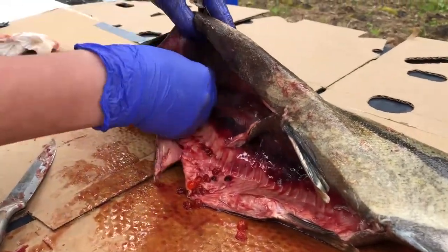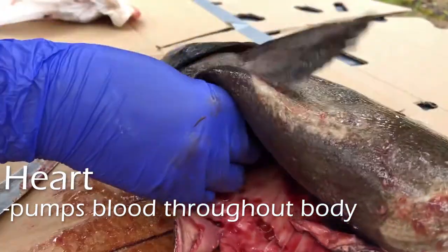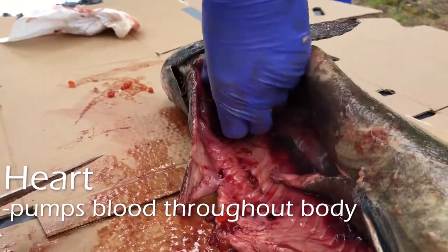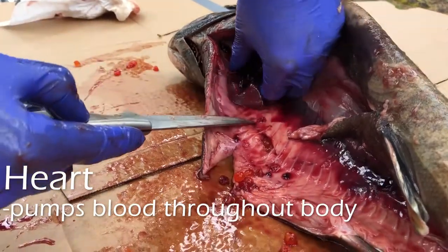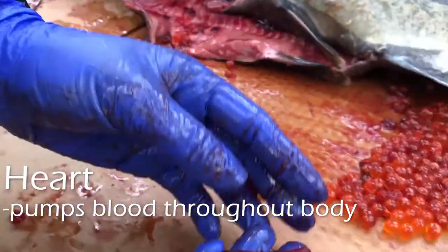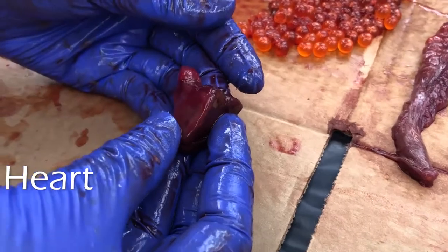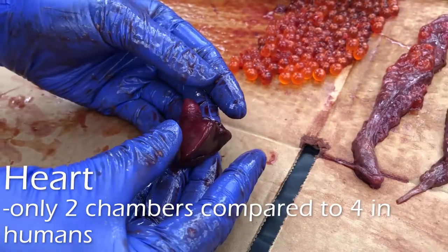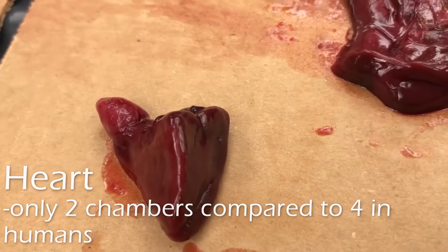Up here we have the heart. It's right up under the chin of the fish, kind of right below the operculum — that bony gill cover. This is the heart of the fish. It is different from human hearts in that a salmon heart is only two-chambered, so it's got one ventricle and one atrium, versus a human heart which has two of each. It's very small and looks quite different from the human heart we are used to.